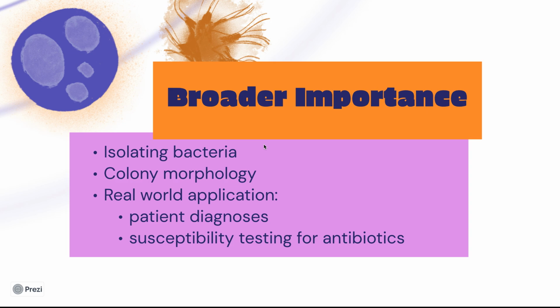So if you're able to isolate those colonies by using this technique, you can then separate and examine each type of bacteria and this would allow for susceptibility testing on individual strains to be performed. And that might mean that each species requires different antibiotic treatment. So this is very valuable information, and it enables a more tailored treatment option based on specific bacteria present.